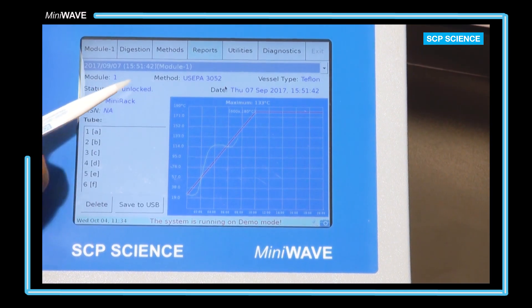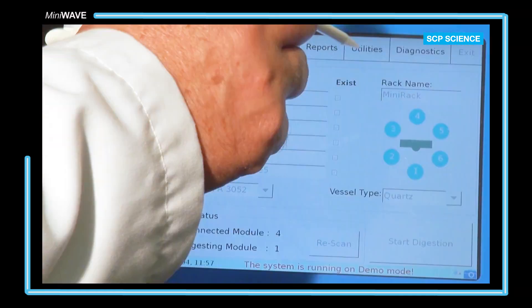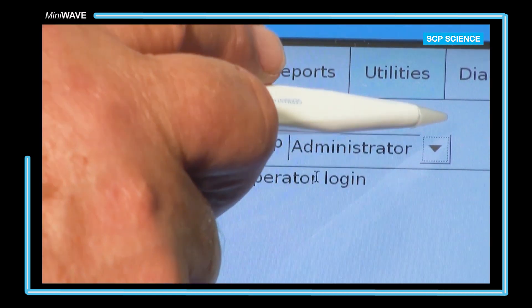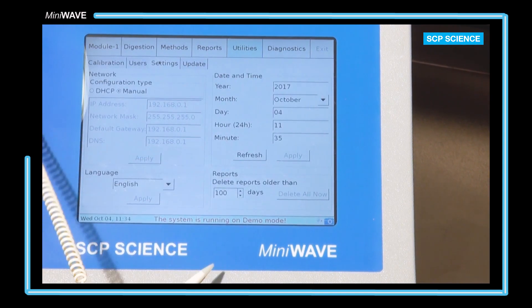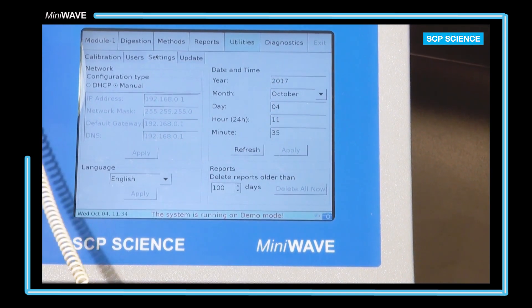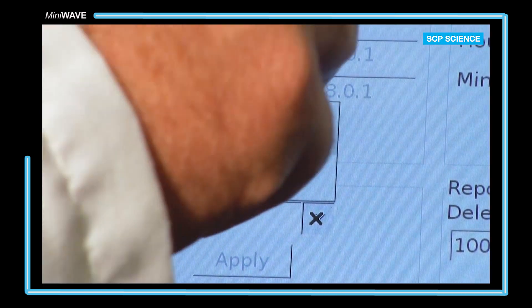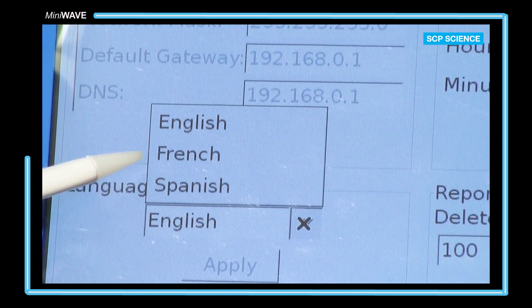From the reports page, the user can select a run that was done and view the results. From the utilities tab, passwords are set. If a user is granted administrative rights, they may create, edit, and delete a method. An operator can only select a method. The settings tab is for setting the date and time, the ethernet connection, language selection, and reporting.